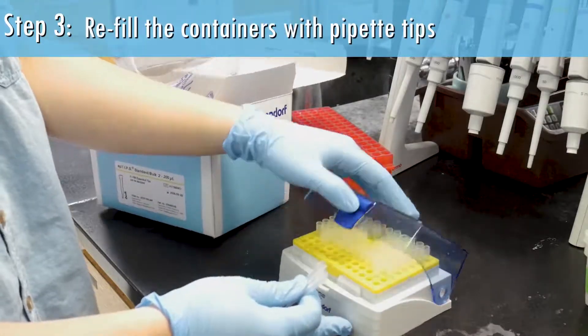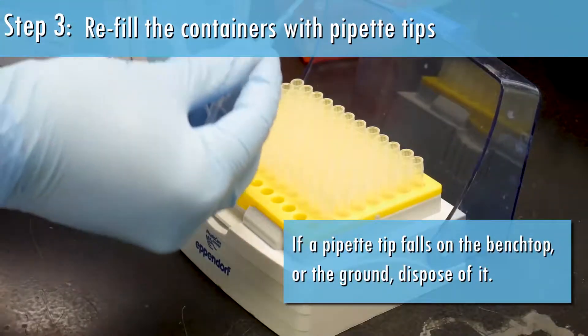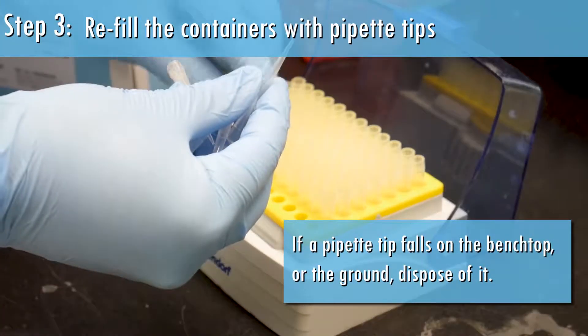Step 3: Refill the containers with pipette tips. If a pipette tip falls on the benchtop or the ground, dispose of it.